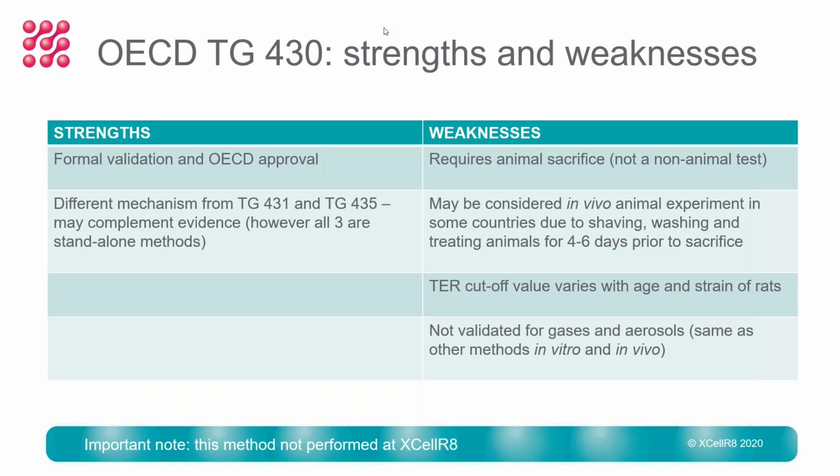It's been shown that the TER cutoff value can vary with the age and strain of the rats, and as with the other methods, this isn't validated for gases or aerosols. Next slide.